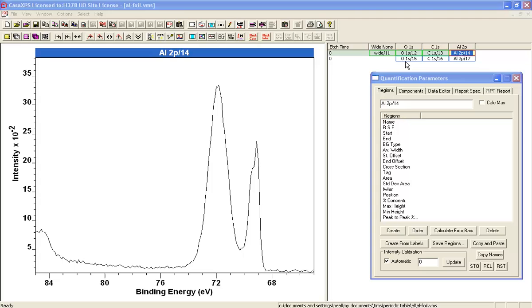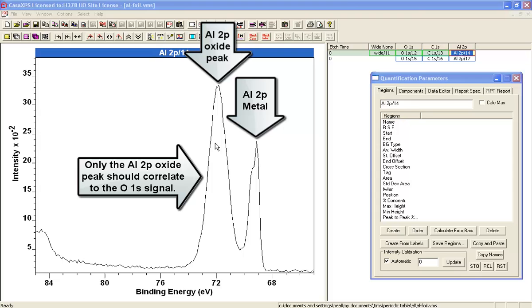We would have expected the oxygen and aluminum to be in the ratio of 3 to 2 for the aluminum foil. The reason that it is not is the aluminum signal is split into an aluminum oxide which should have the correct ratio and additional signal which is metallic.